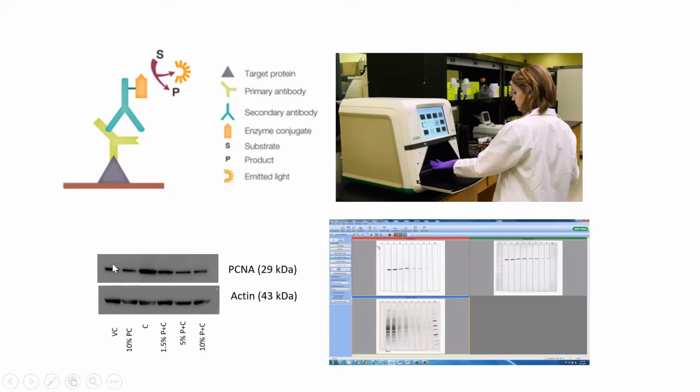No, go ahead. So these blots are then used for immunoblotting. The principle is the same as that used in IHC. That is, epitope, then the primary antibody against that specific epitope, and a secondary antibody against the primary antibody. This secondary antibody is directly labeled with an enzyme; there is no ABC complex there.